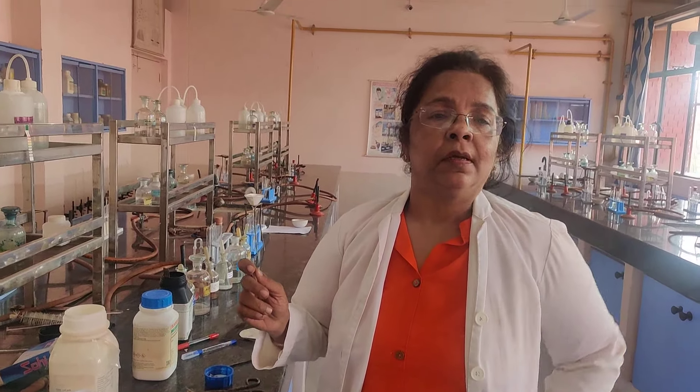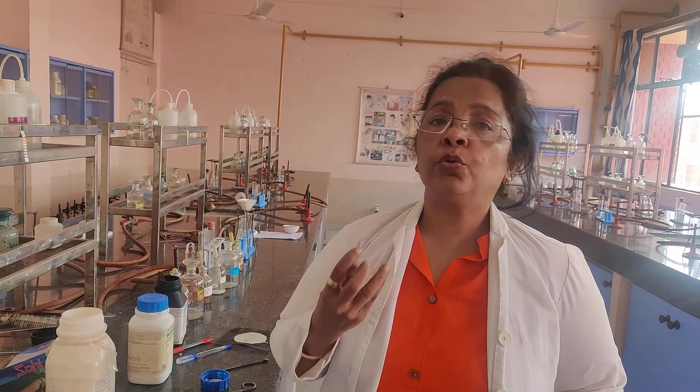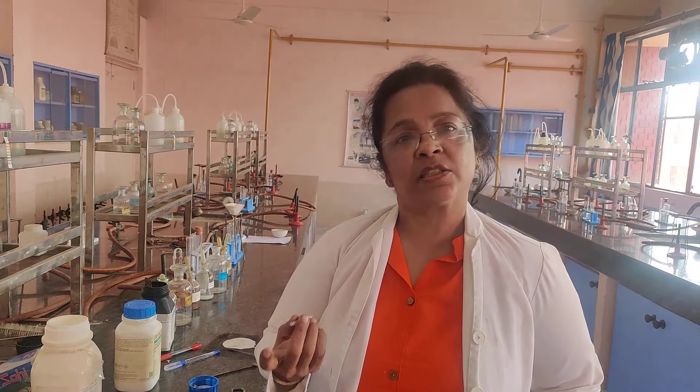Good afternoon, class 11. The agenda for today's class is we will be performing extra element tests in the organic compound. To do that, you need to prepare something known as Lassaigne extract.